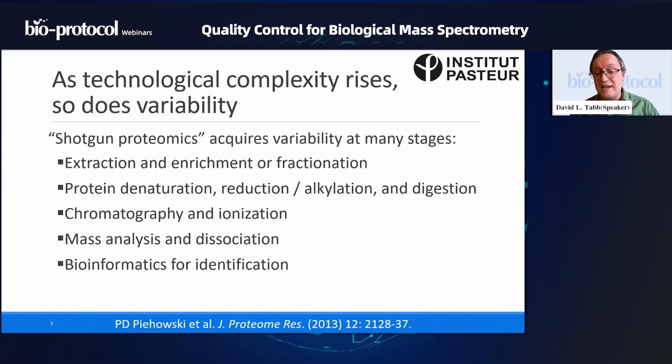The way that chromatography takes place can certainly differ. Ionization, yes, sometimes you can have the source varying a little bit in the voltage on it, or the temperature in the heated capillary, any number of things here. The way that mass analysis occurs can certainly differ. Your instrument may be in calibration or out of calibration. The way that dissociation is taking place can change based on the pressure of gas, for example, in the place where you're doing CID. And a lot of people don't think about this, but the bioinformatics we use for making sense of these data can also lead to variability.